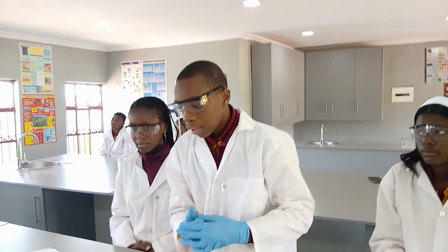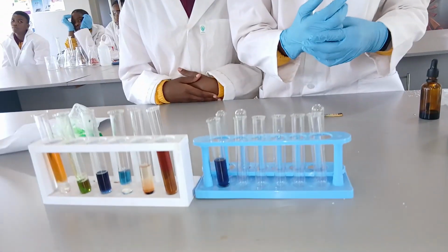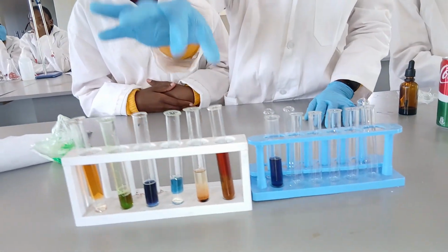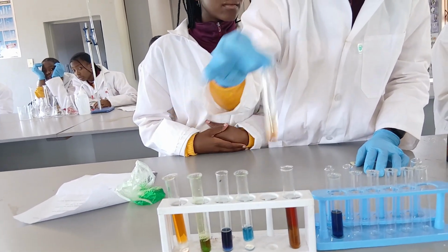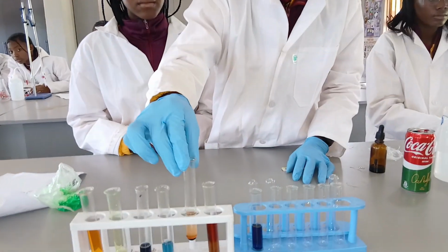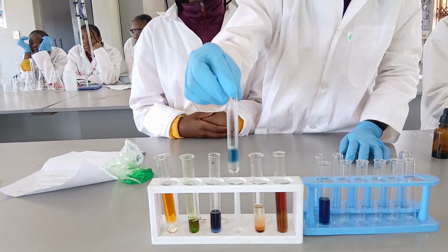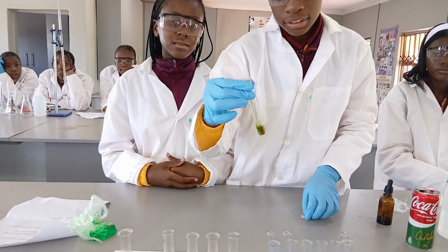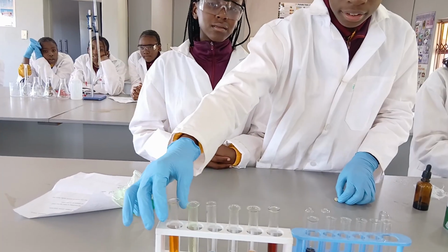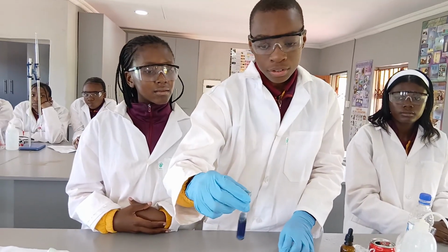So in conclusion, I have tested most of some basic household substances. So these are the results. Coke is an acid. Cooking oil is also an acid. This is our soap, which is a base. This is our sunlight, which is an acid. This, which is also an acid, and our last example, which is water, is neutral.